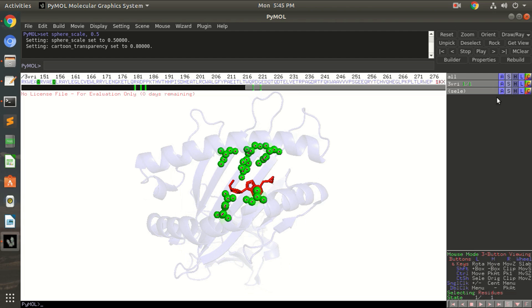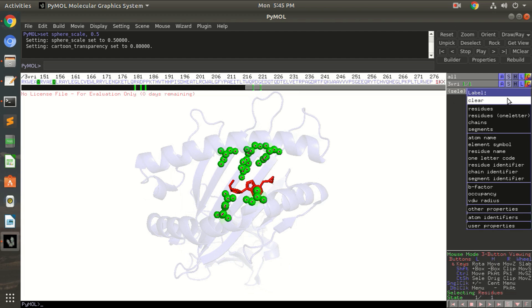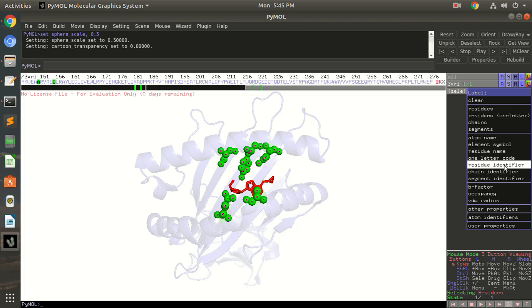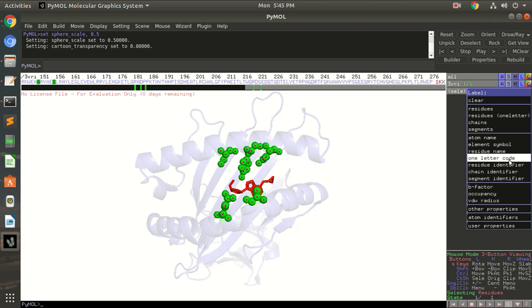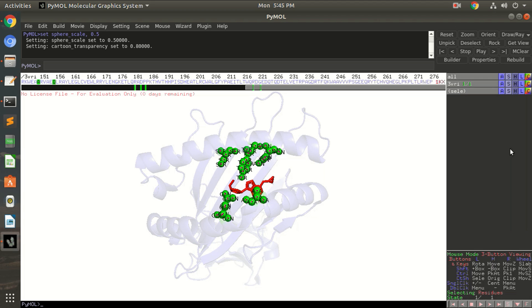If you want to make it more transparent then set it to 80 percent. Okay, now you can label these residues and just again go to this panel, in the selected row go to L column, label residues as you wish. You want as one letter or the residue identifier or just the residue name.